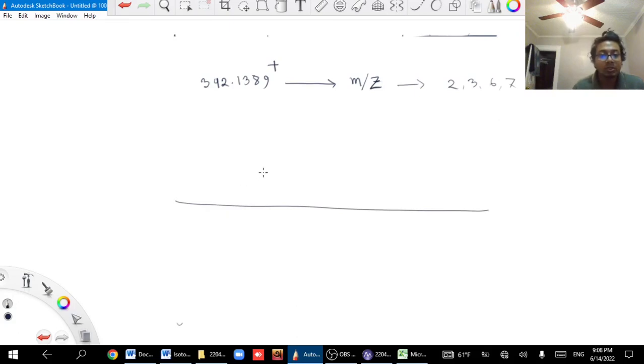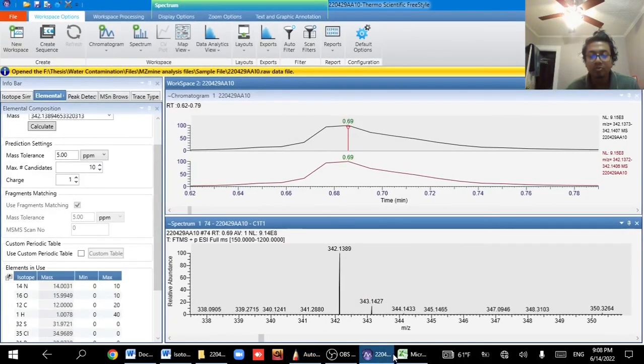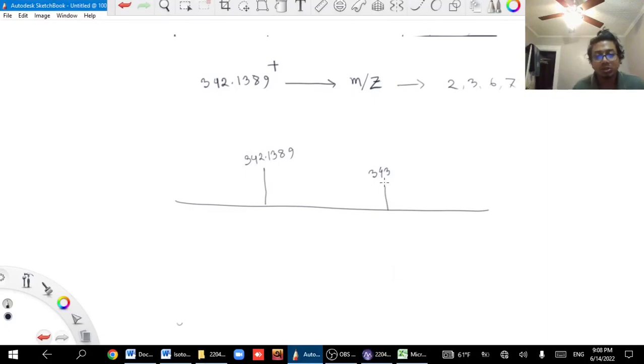So you get that value like 342.1389. Here you got 343.1427. I need to remember that.